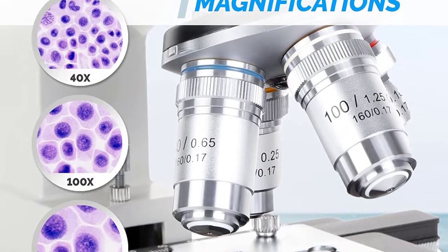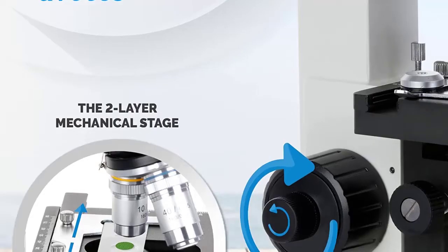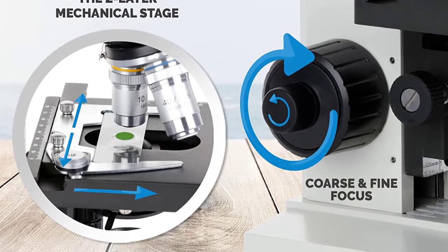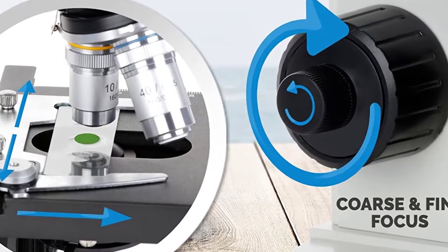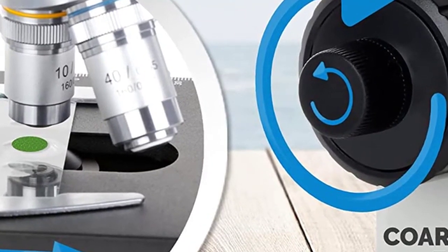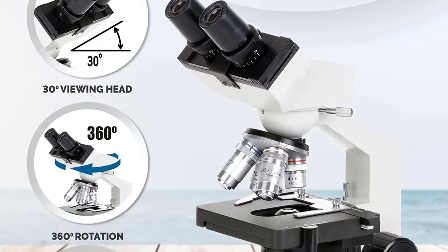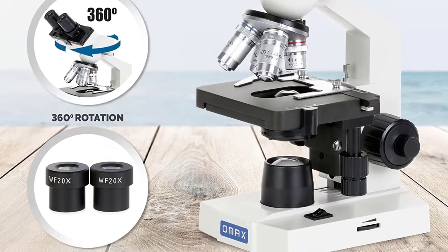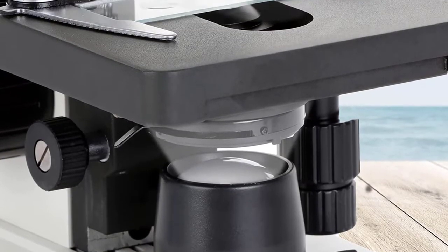Product details: light source type LED, material metal, color silver, white, and black. Item dimensions 9.06 by 7.13 by 13 inches. Total magnification: 40x, 80x, 100x, 200x, 400x, 800x, 1000x, and 2000x.